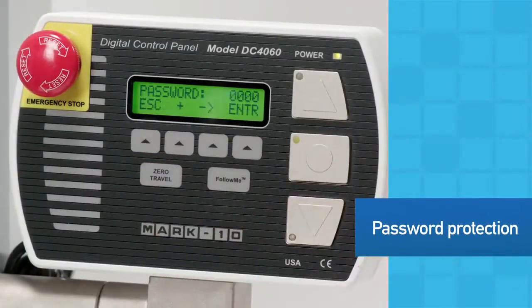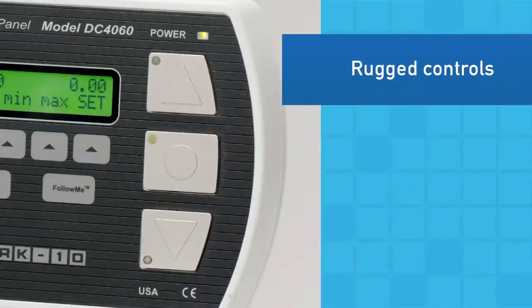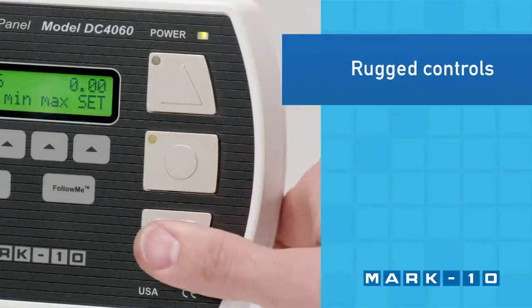Password protect the menu to prevent unauthorized changes. Rugged aluminum up, down, and stop buttons are designed to withstand the rigors of daily use in industrial environments.